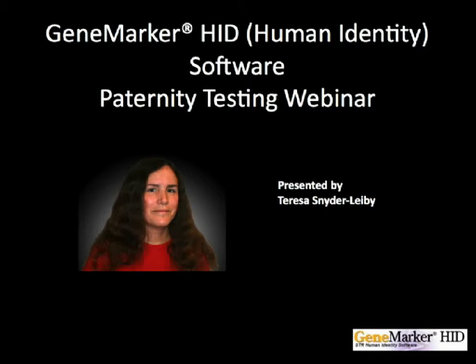GeneMarker HID software is an expert system for forensic STR DNA analysis. The basic functions of GeneMarker HID are covered in the introductory webinar. Please review the introductory webinar prior to beginning specialized applications.